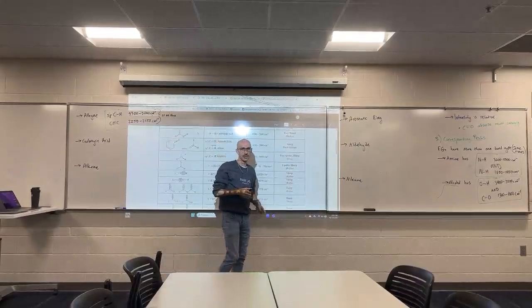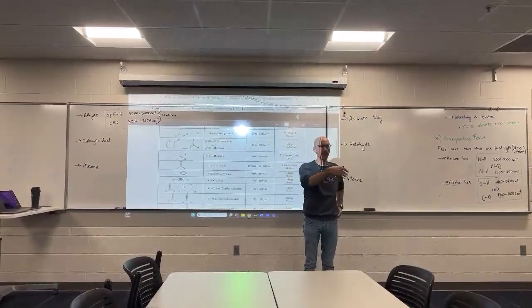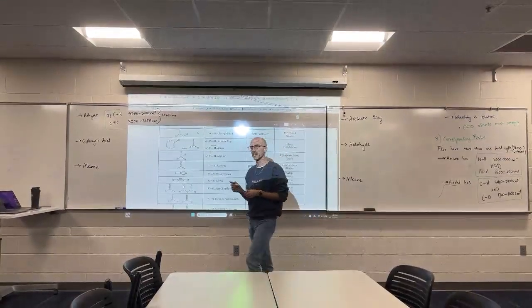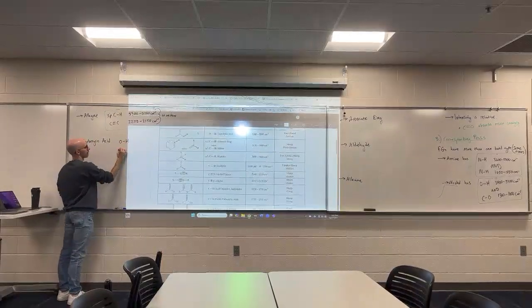Now I had two groups that gave me the carboxylic acid. So let's see if you guys agree. Actually, maybe I didn't. Yeah, you guys did? You did, right? Carboxylic acid. What did you find? What bond types would you expect? OH single bond and CO double bond.